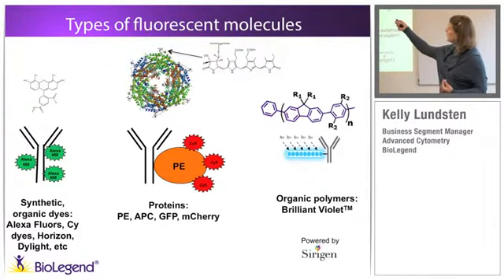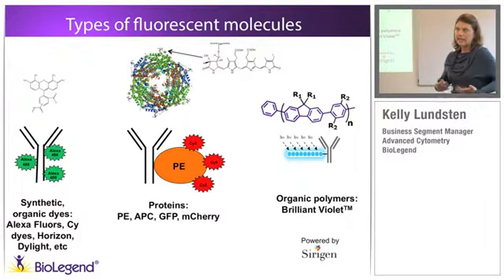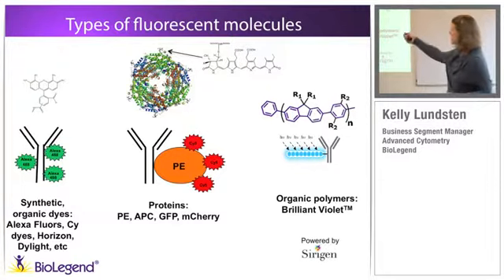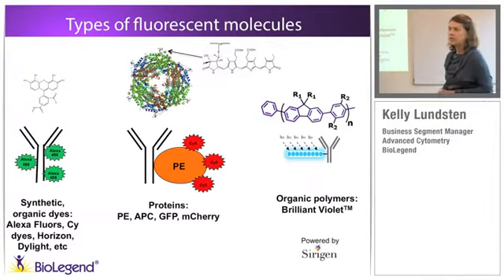So that protein is essential for encasing and embedding this molecule, because as you can see from the structure of the bilin, there are a lot of points where the molecule can rotate, and no fluorophore can rotate and remain quantum efficient. It can't continue to hold its energy and be able to rotate around in space. So it requires that very rigid embedment into that PE in order for it to remain fluorescent.